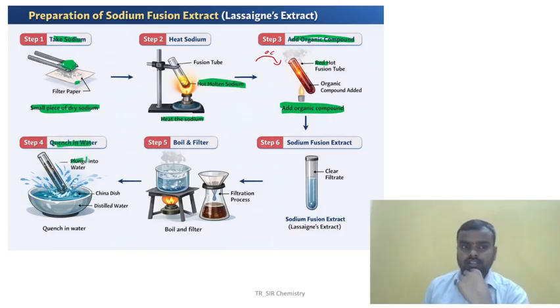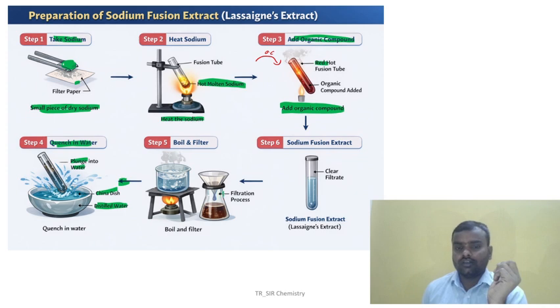water, right? Plunge it into the water, so it cools down. Plunge it into a small dish of distilled water. In the distilled water, we need to dip the red hot tube. After dipping, we again take this and boil it at a little higher temperature, not as much as in the previous case. After boiling, take the filter paper and go to the filtration process.